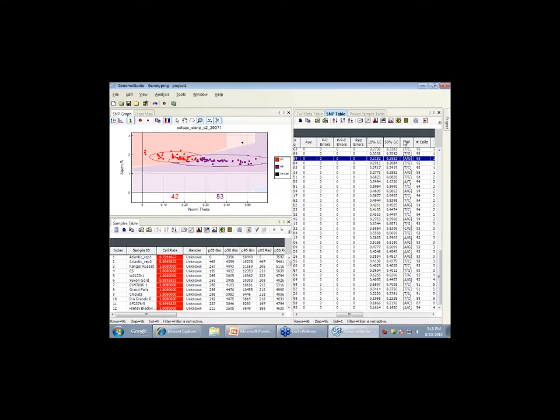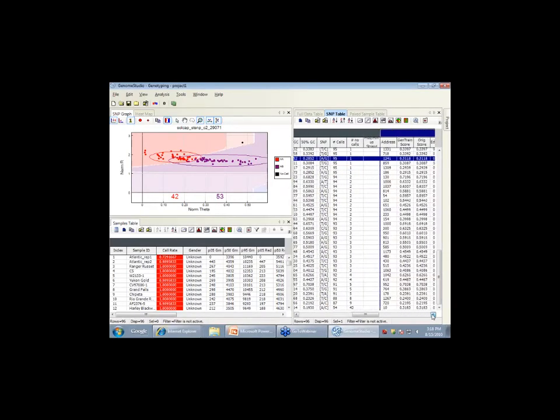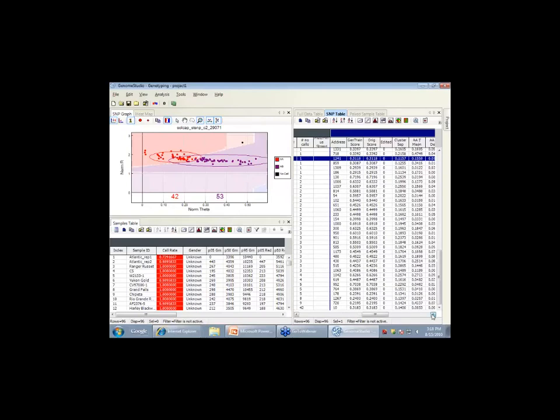Those are relevant. But what you do want to see is, in this column, the SNPs. So it tells you what it is. It's an AG SNP in my case that I'm showing. 95 of the samples out of 96 were actually called, and there's only one missing. Let me see a number.